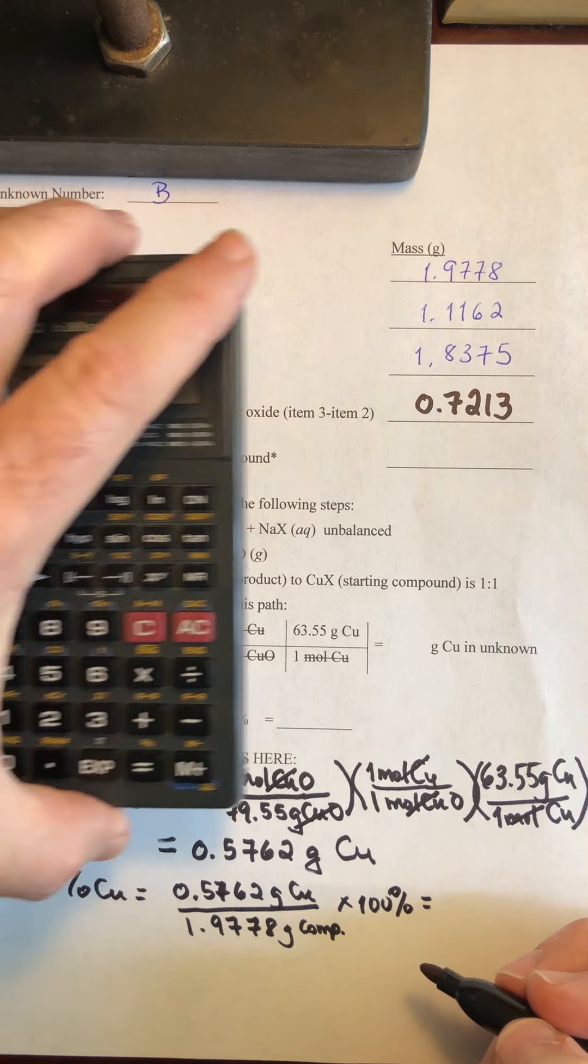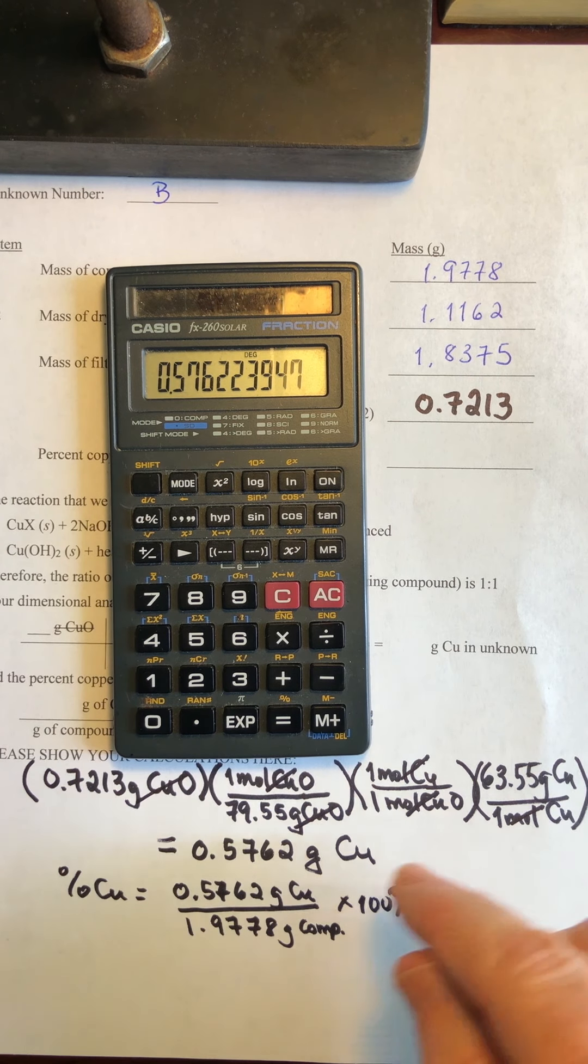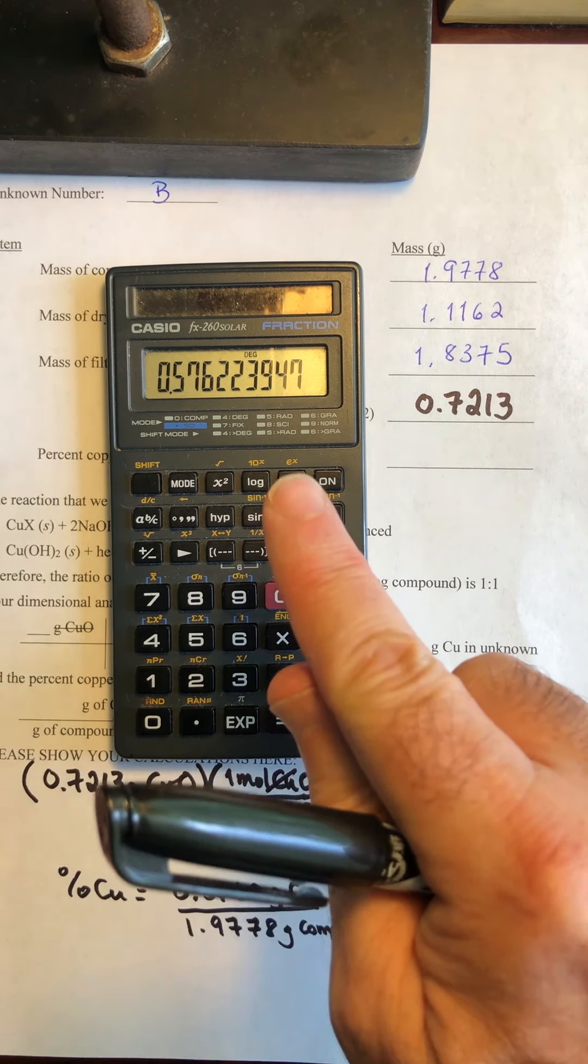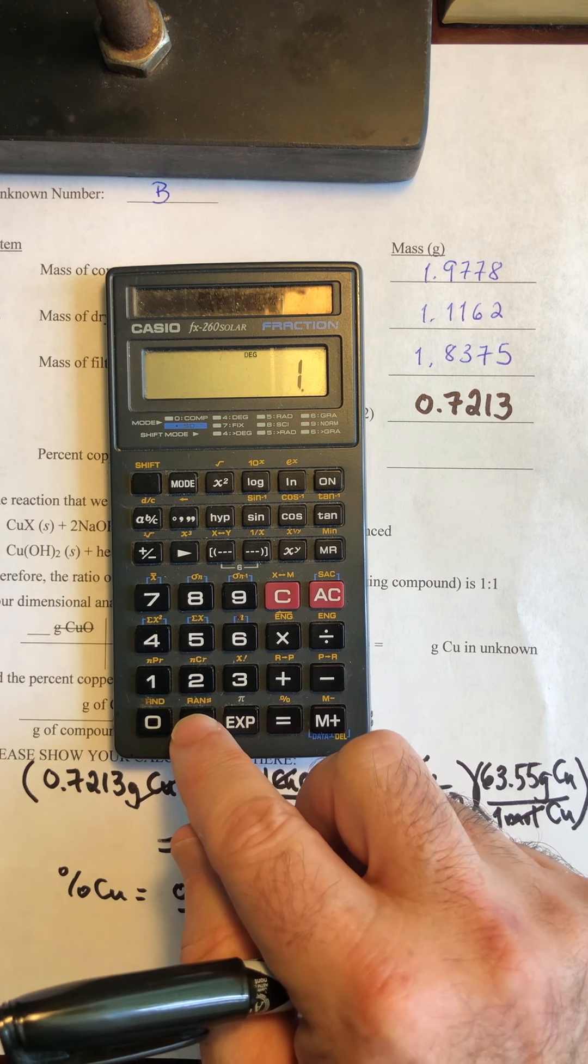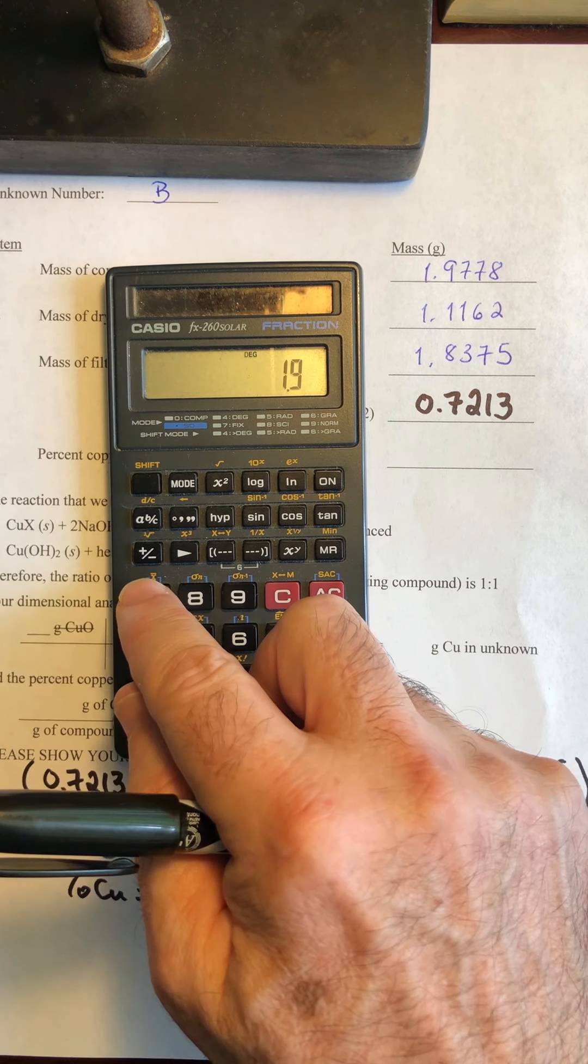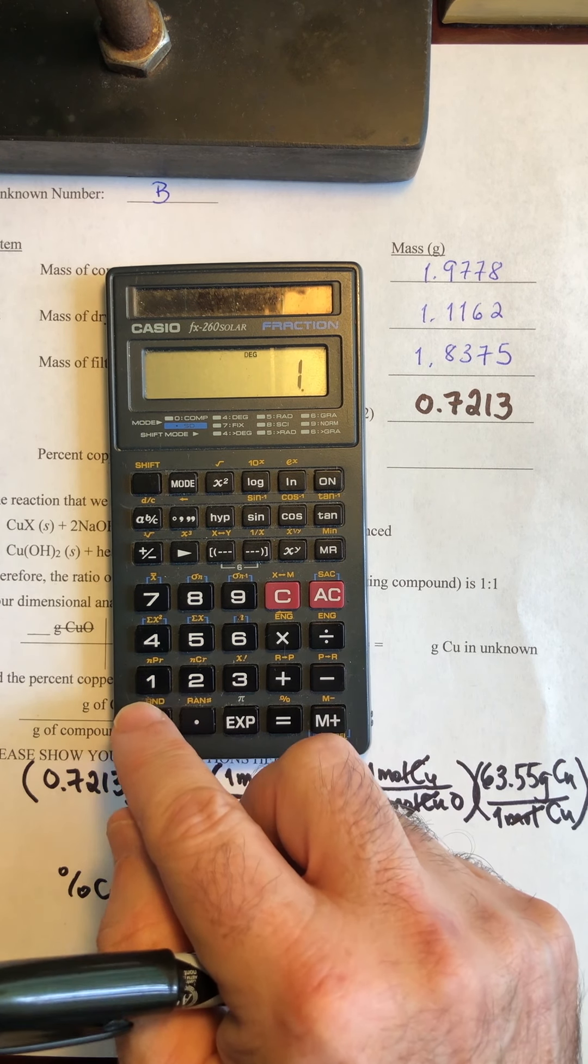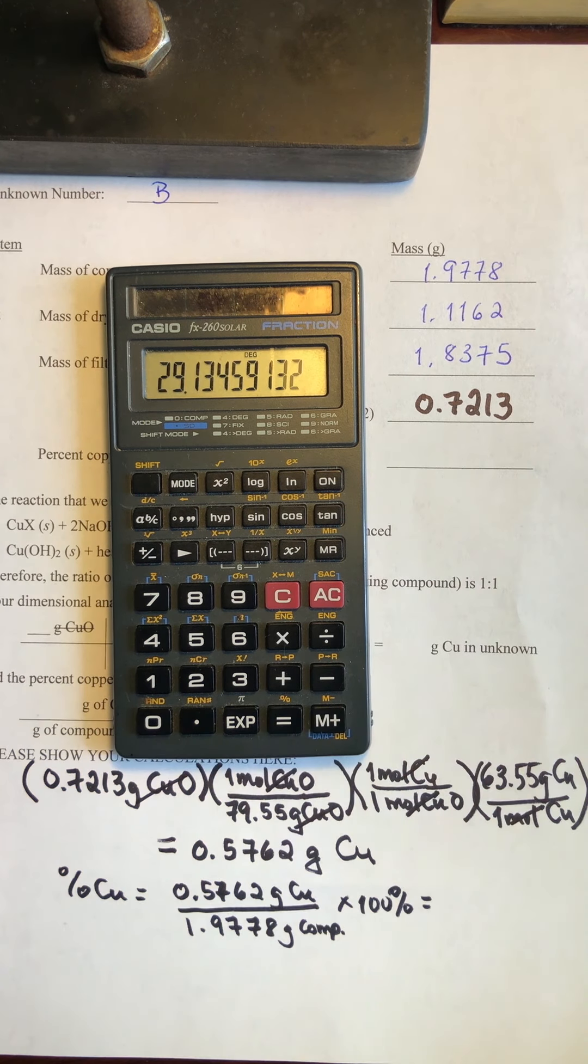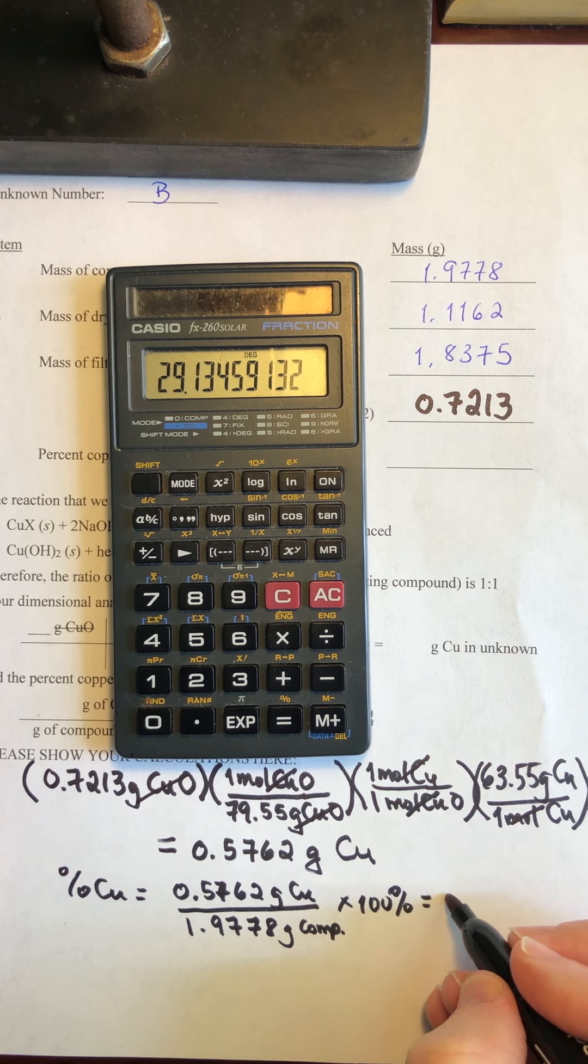So I left my number here in the calculator. Typically, we round at the end of it. So I left that in there, but I actually left it in my calculator. I'm going to divide by the total mass, 1.9778. And that's going to be multiplied times 100 to get the percent. And we get 29.13. We have four sig figs here, so we're going to leave it at that.